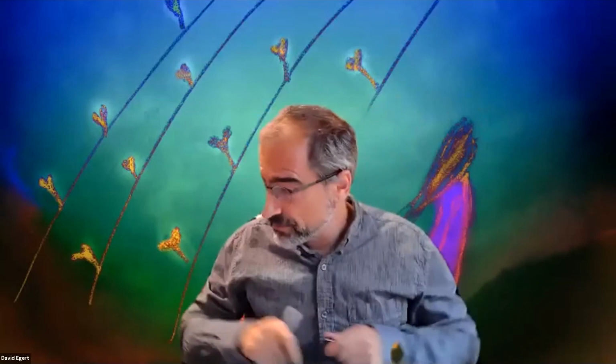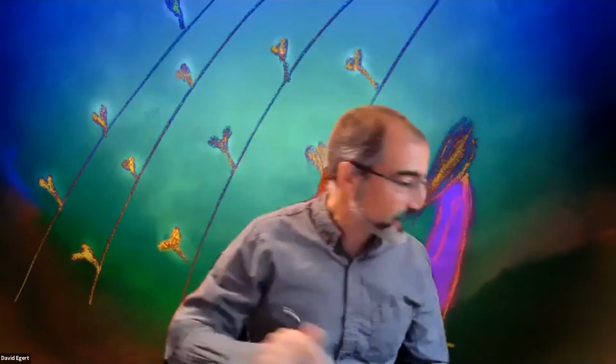Probably contaminated. Exactly. Have you heard, Lauren? It's probably contaminated. People have been putting oil in the beakers and then they didn't wash them well. So when you put the water in the beaker, some of the oil that was still in there floated to the top. So this brings in this idea. Maybe I can write it.